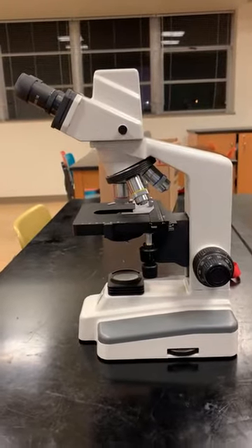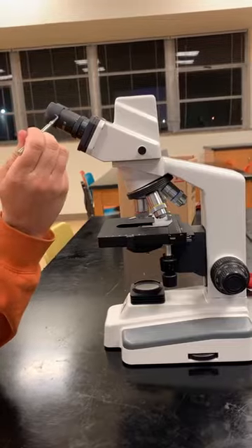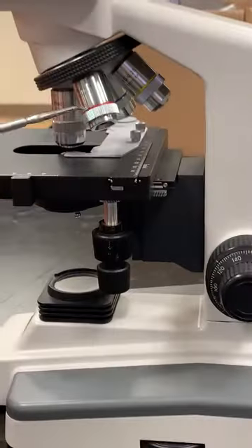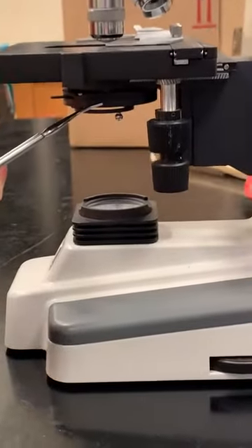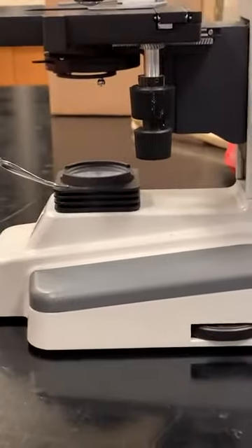I'm going to go over the microscope. When you look at the microscope, this is the eyepiece. This right here is called the revolving nosepiece. These are called the objective lenses. You have the stage. Underneath the stage, you have the iris diaphragm, and then you have the illuminator.